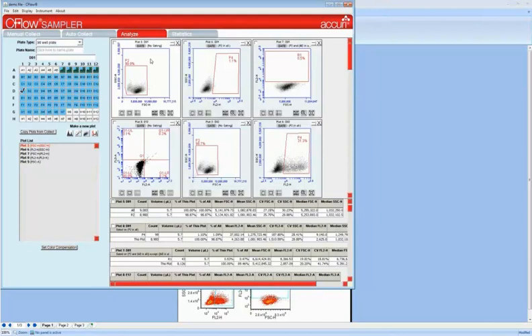That's because this plot was zoomed. Because of the huge range in CFlow, they have a very handy zoom feature that lets you highlight particular populations. If I click on this button, it unzooms it. If I click on the zoom, I can now go in and just look at a subset.